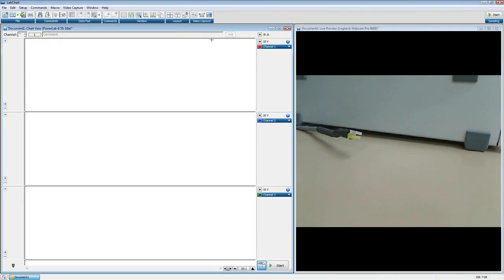As I said before, fast response output is an extension you would download and enable in the feature manager. That's not built into LabChart. But with fast response output, everything that is used with it occurs in the PowerLab, so it's all hardware-based and very, very fast. You can have response times with lags less than 1 millisecond. But it has to be an analog input, like a raw data input to the front of the PowerLab.